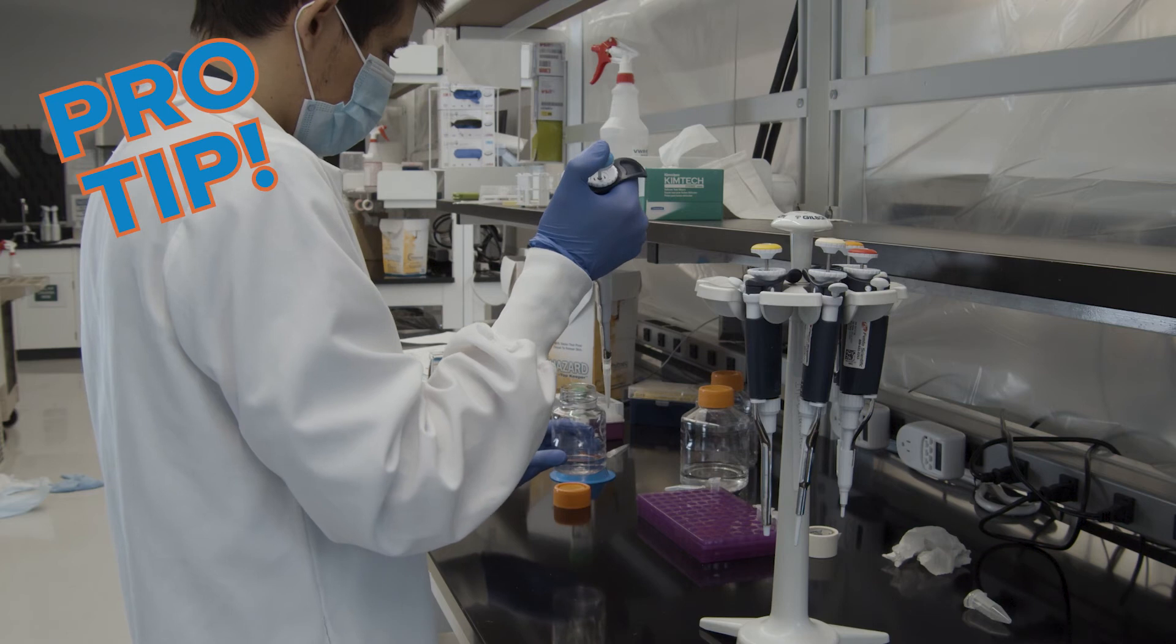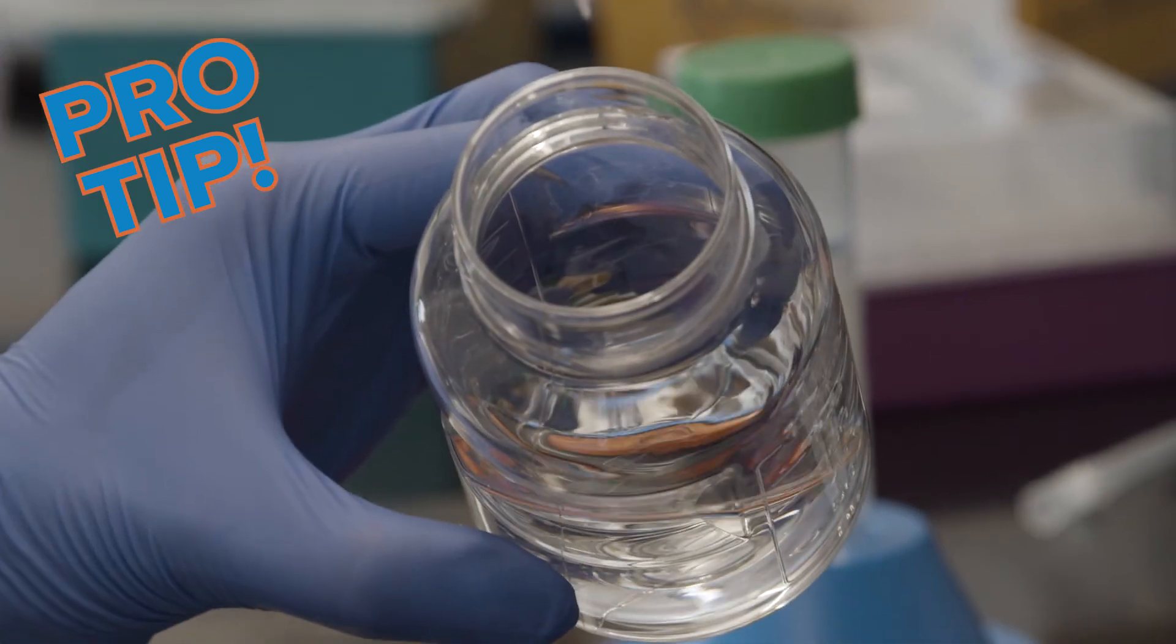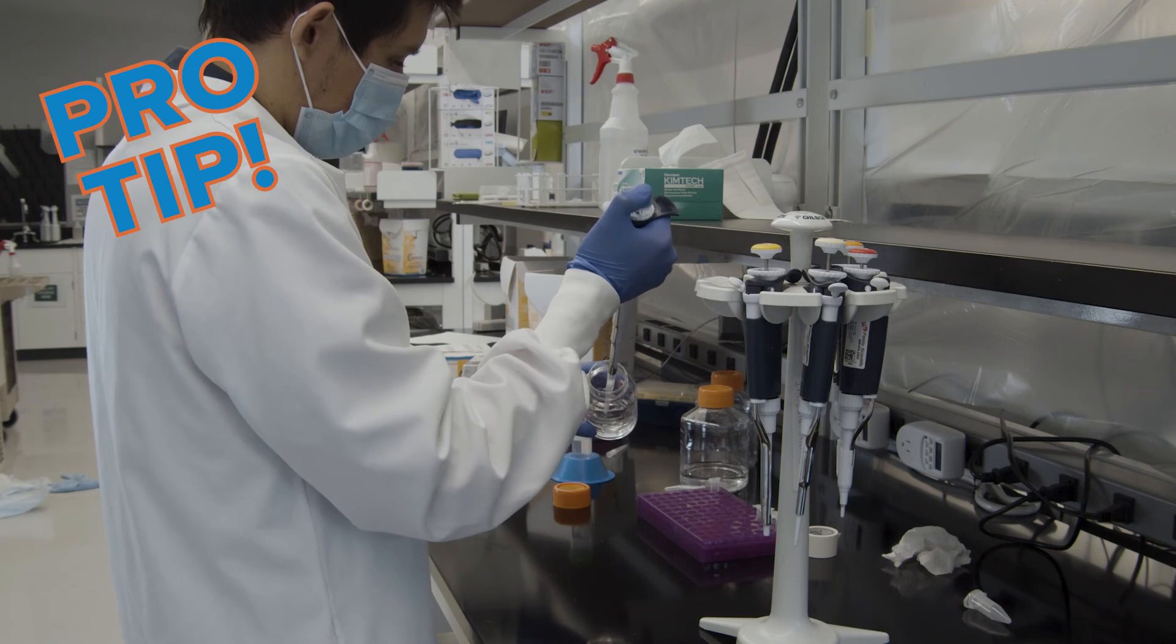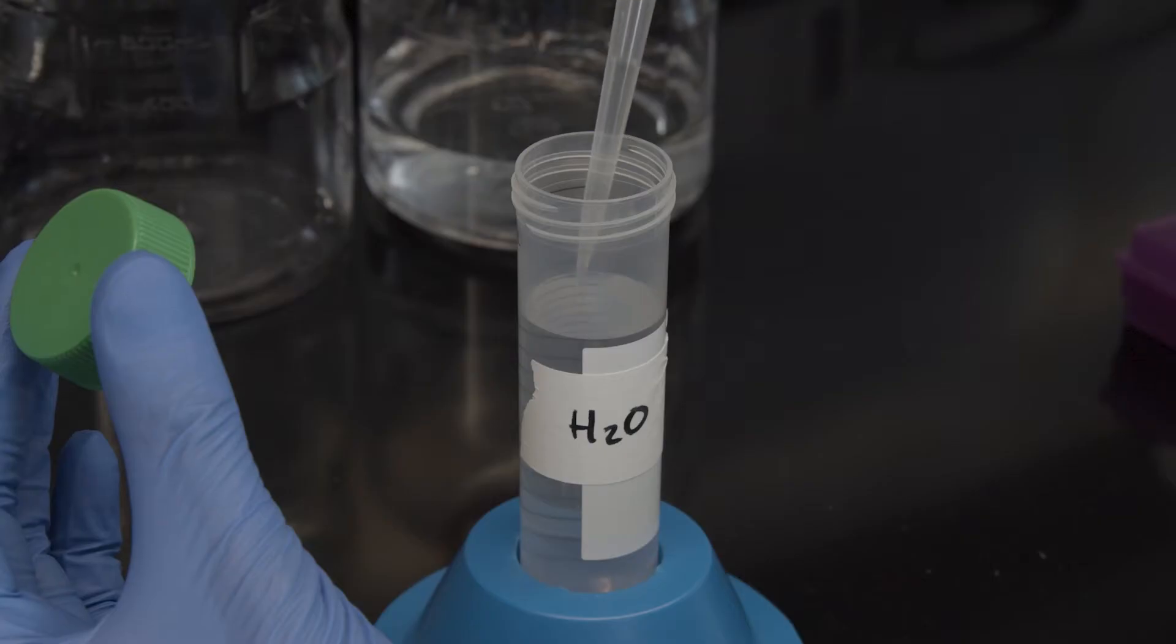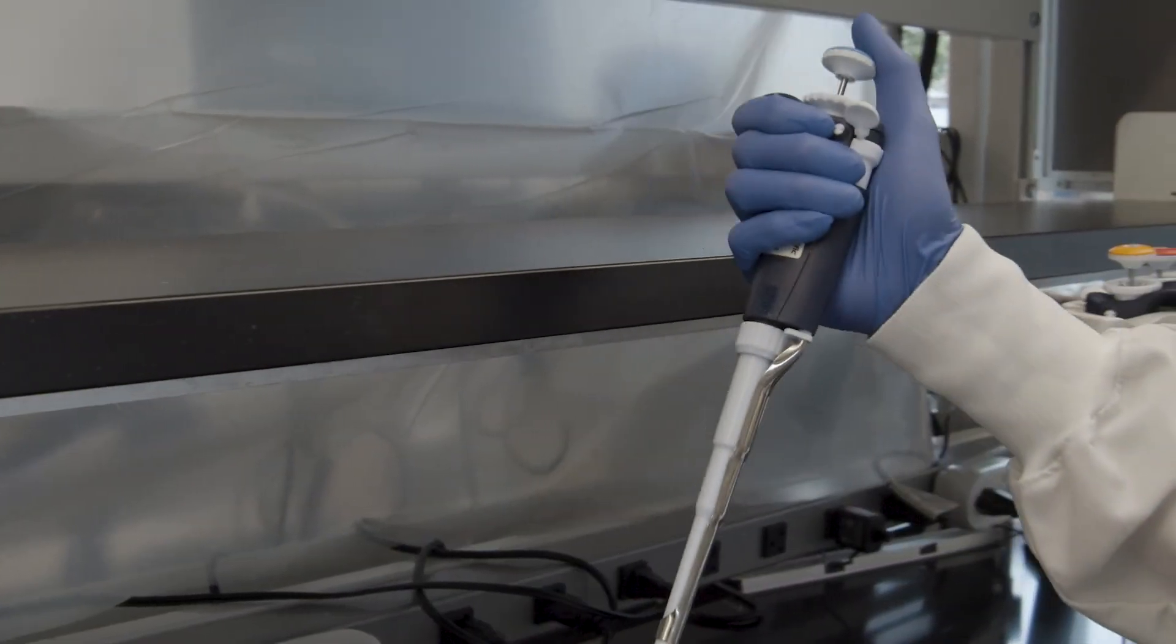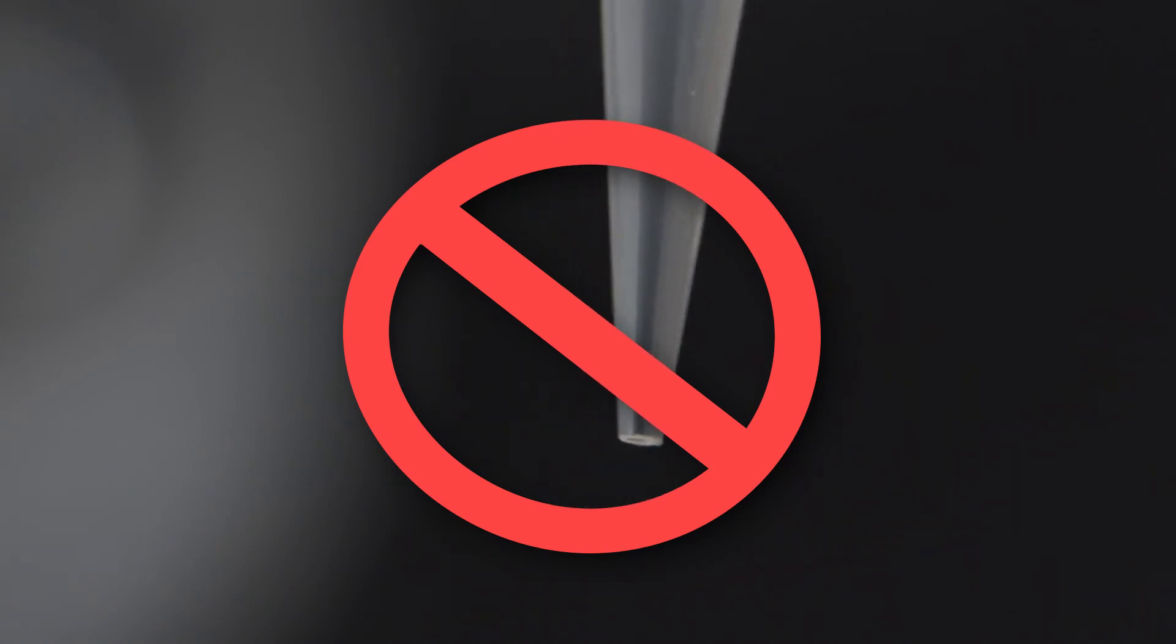If you're pipetting from a relatively large container holding a small amount of liquid, tilt the container so it's easier to reach the liquid. Once the liquid is finished drawing into the pipette tip, lift the pipette so that the tip exits the liquid. When you're lifting the pipette tip from the liquid, no liquid should drip from the tip. If it does, this could indicate the tip is not properly seated on the pipette.